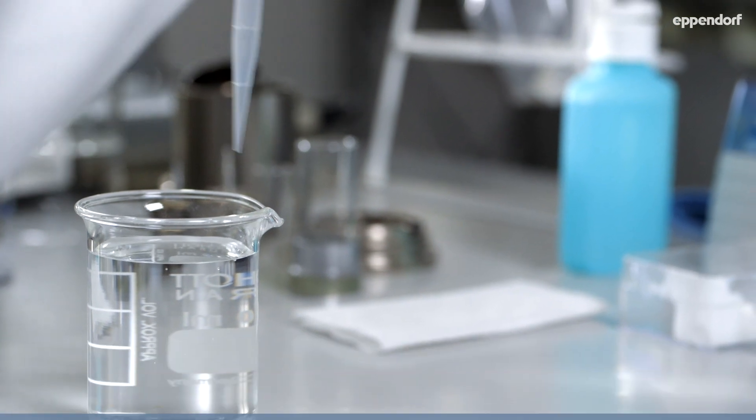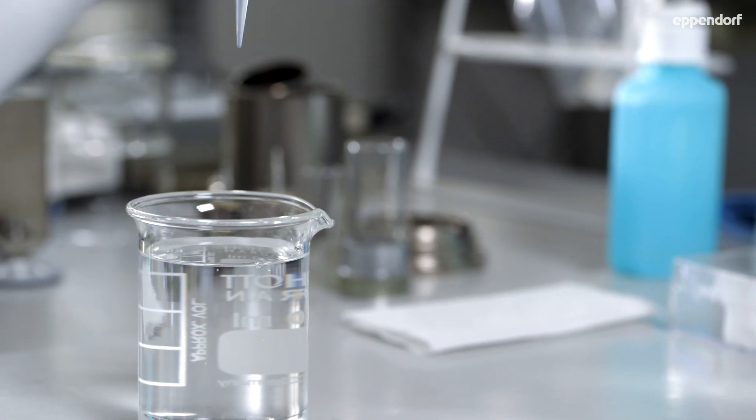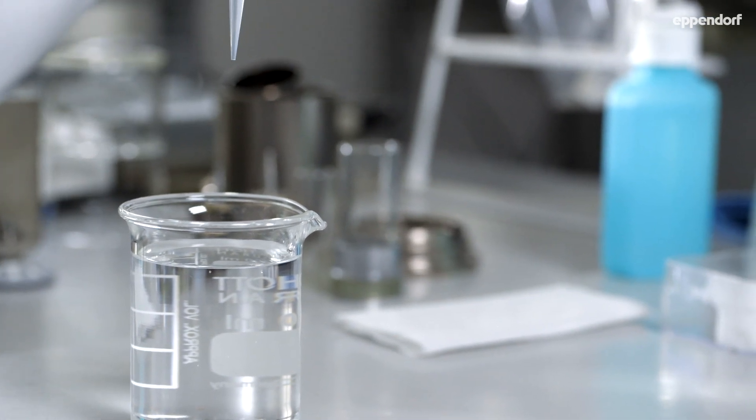At Eppendorf, we ensure our stringent and validated calibration procedures follow ISO 8655.